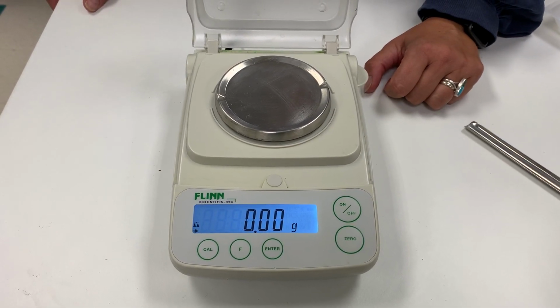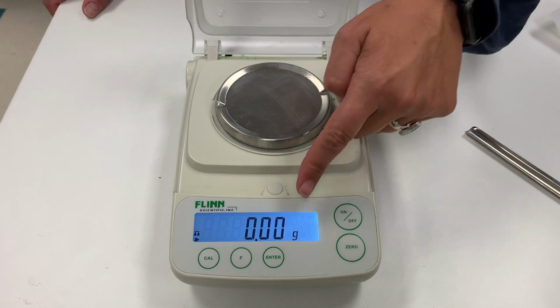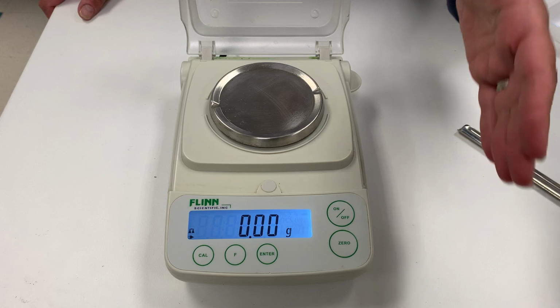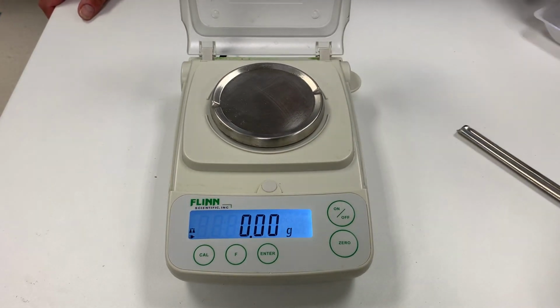And there it is. Once you get to your zeros, check for grams. If there's not grams, let your teacher know and they will fix it. Don't fix it yourself or else you might break it. Now it's time to weigh things.